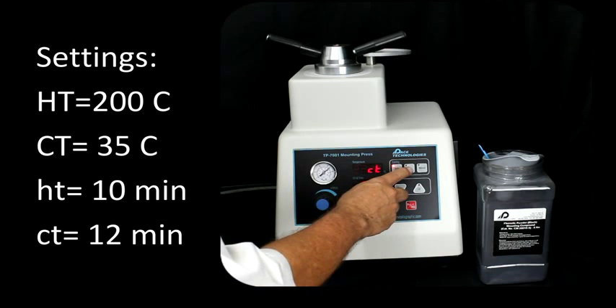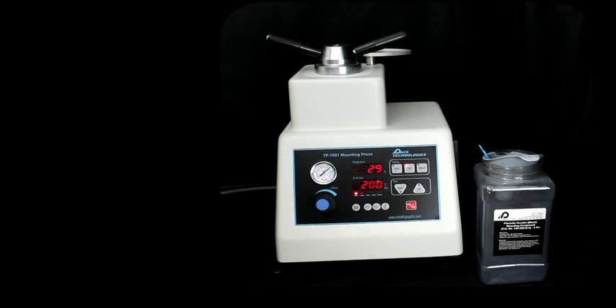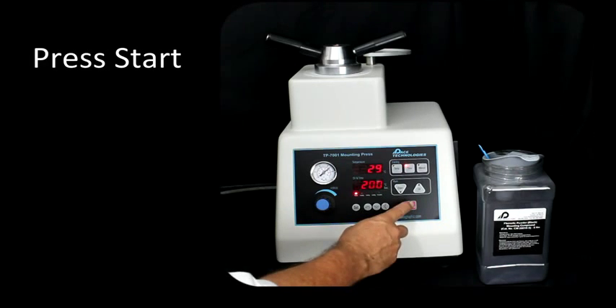The cooling time, if we press time here — let's go ahead and do that — will be 12 minutes. So we're all set to go. Just hit the start button.